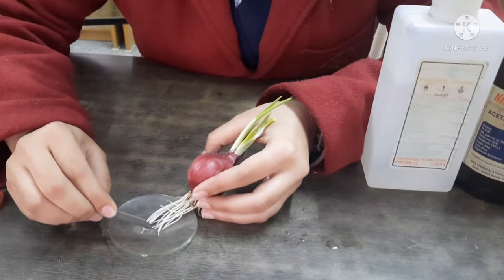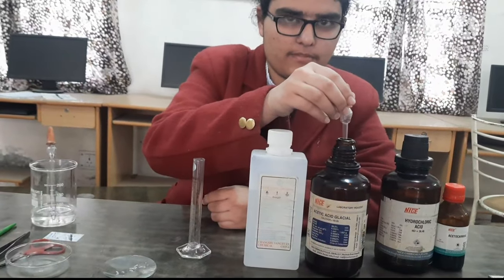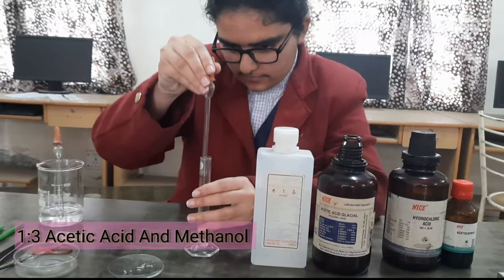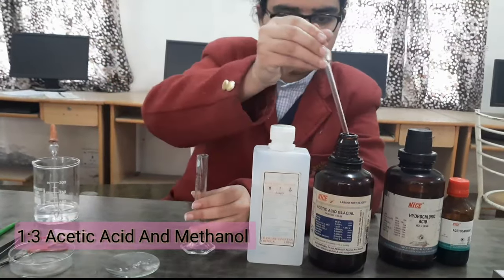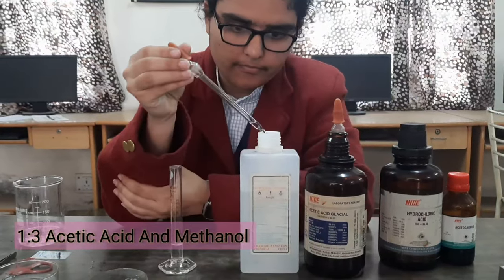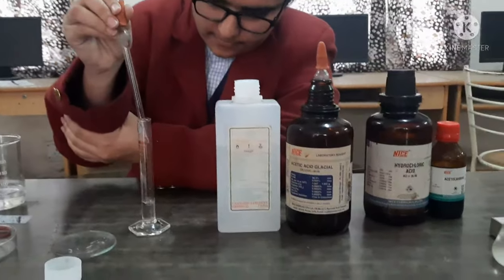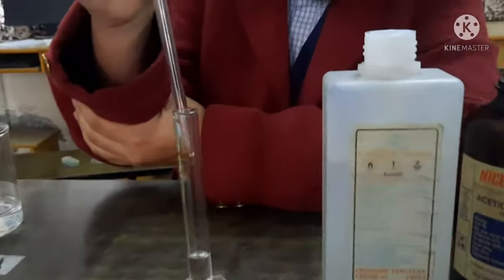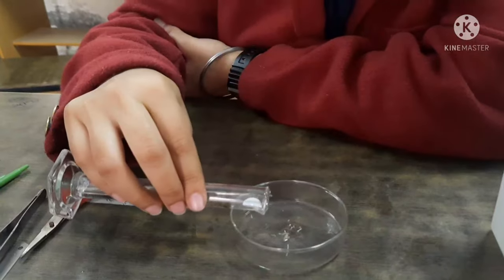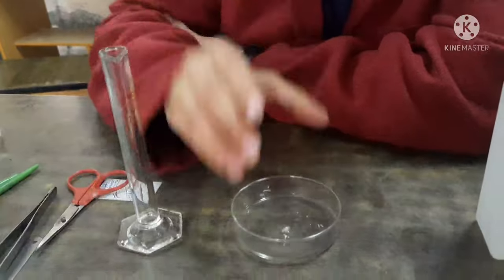Now cut the tips of the roots and put them for fixation in a mixture containing 1:3 acetic acid and alcohol. Keep the roots for fixation for about 1 hour.